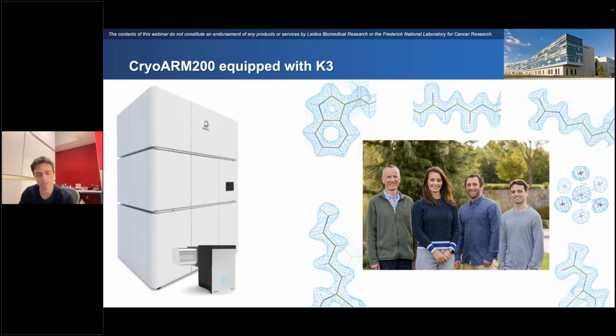So in Shriram's lab, we used the Krios, which ran at 300 kV, the Krios being from Thermo Fisher FEI. And then up here, Shriram made the call to go with a 200 kV scope and also to go with a scope from a new, different vendor than he had before, from JEOL. And Shriram, for various reasons, was really excited. He really believed in the potential of the CryoARM 200 to produce high resolution structures.